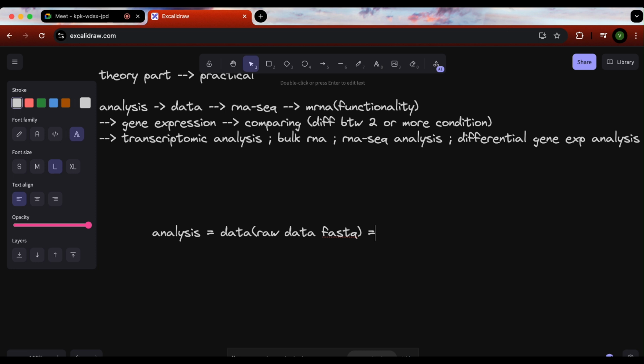Okay, and the other thing which we require is tools. Now the tools, obviously, because we are doing dry lab bioinformatics, we require software tools. So we are using a direct tool which we are interested in, and you will see that this is the tool I'm using. Okay, plus each tool is made up of different languages, so they have different dependencies which are required.